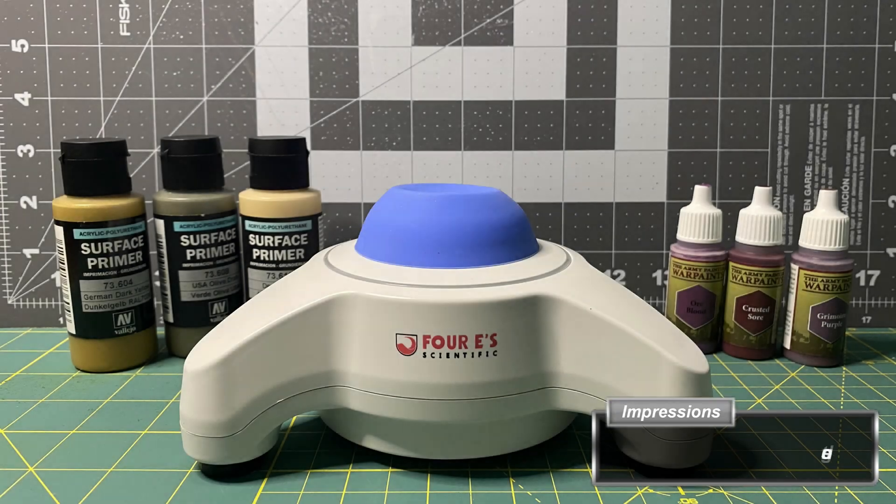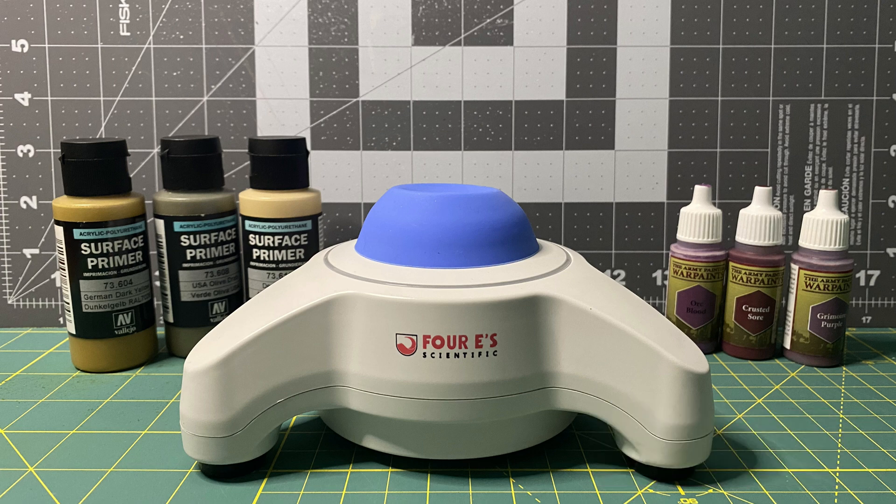The first major thing to note is the difference in how loud they are. The 4E Scientific Lab Vortex Shaker is quiet enough that I can run it at night without waking up my wife on the other end of the hall, whereas the fingernail polish shaker will most assuredly rouse her wrath.